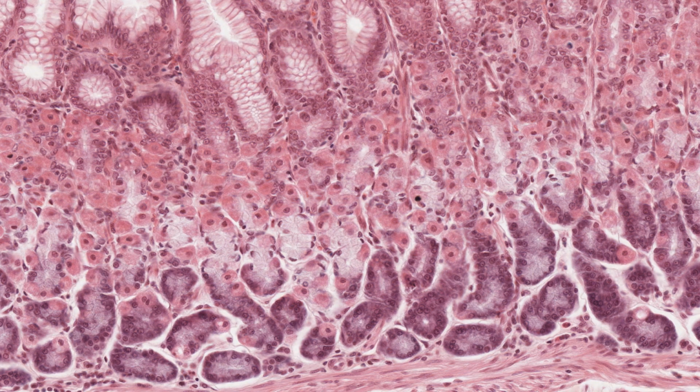The more bluish stained cells down the bottom are exhibiting basophilia. Their nuclei stain a very dark purple colour, and here you see that the cytoplasm, unlike the red stained parietal cells, is stained pale blue. They're chief cells of the stomach. They're synthesizing pepsinogen, and that requires an enormous factory of granular endoplasmic reticulum and ribosomes. And if you remember back a few moments ago, I said endoplasmic reticulum is highly basophilic. And you see it clearly here because it's dominating the cytoplasm of the cell.